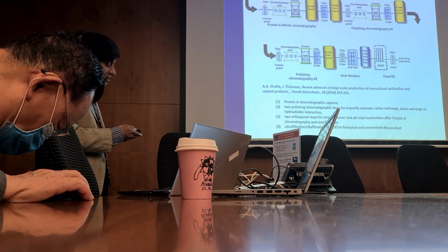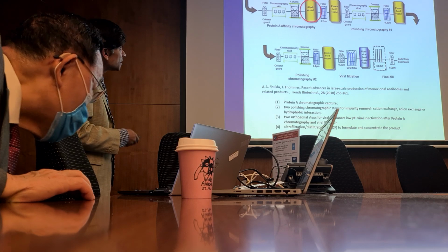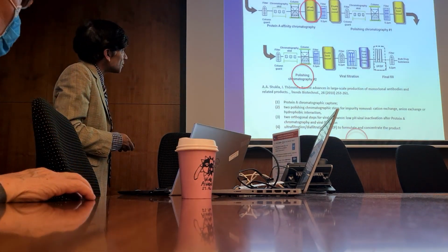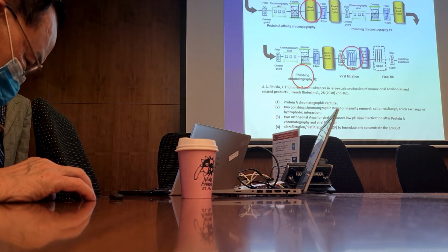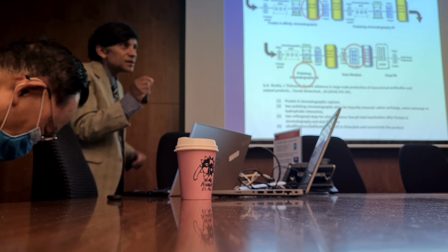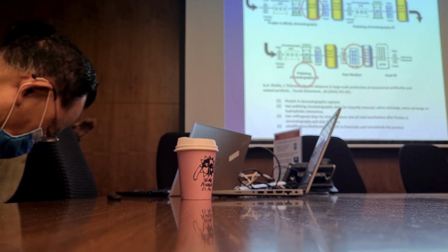So if we look at this, besides that, there are many other things that occur. You can see a pH adjustment vessel here. Typically, one of these polishing steps is also involved, and a virus filter is involved. All three are typically used to validate virus clearance, because one process by itself would not be adequate, because the level of clearance you have to show is too much, okay? And there are reasons for that which we could discuss.